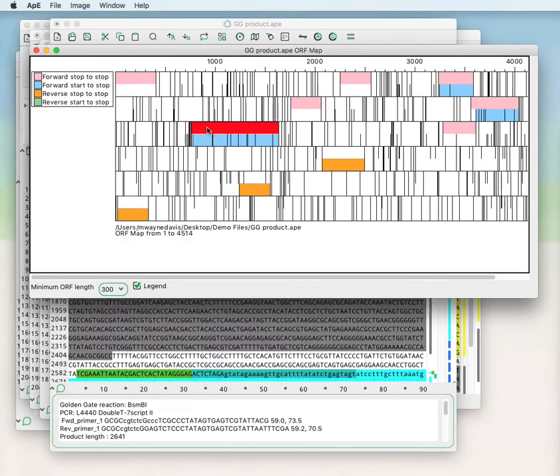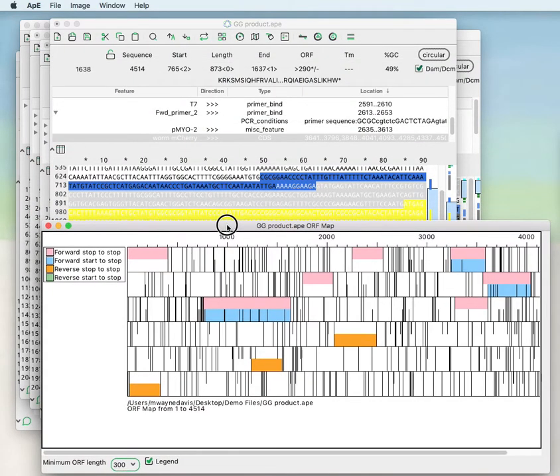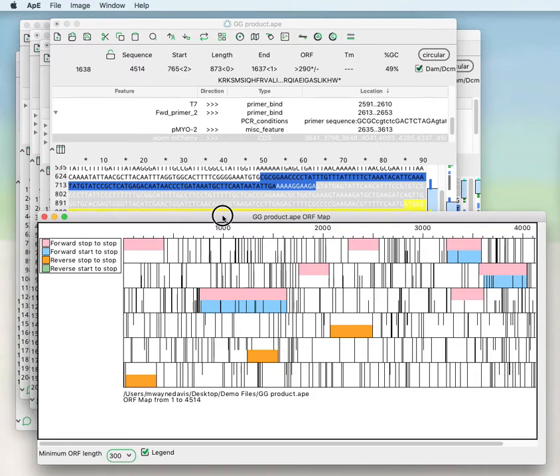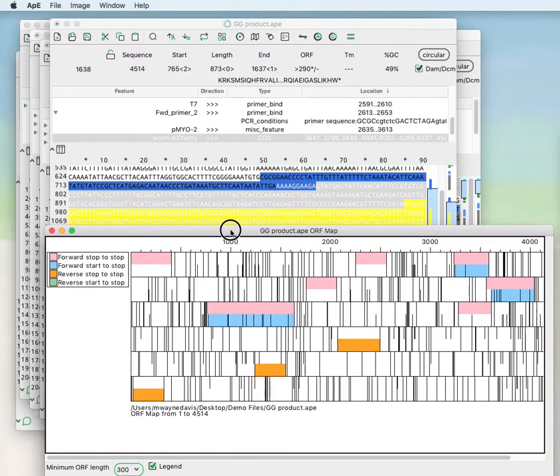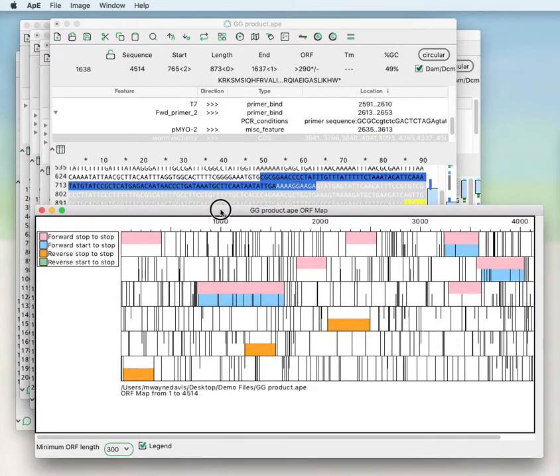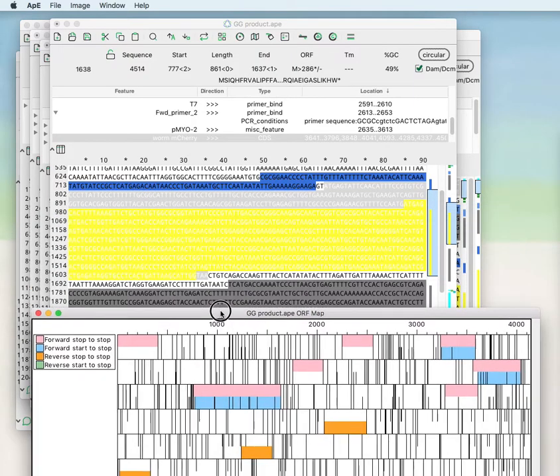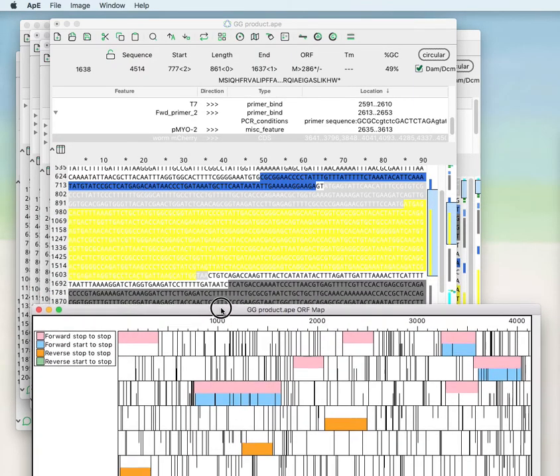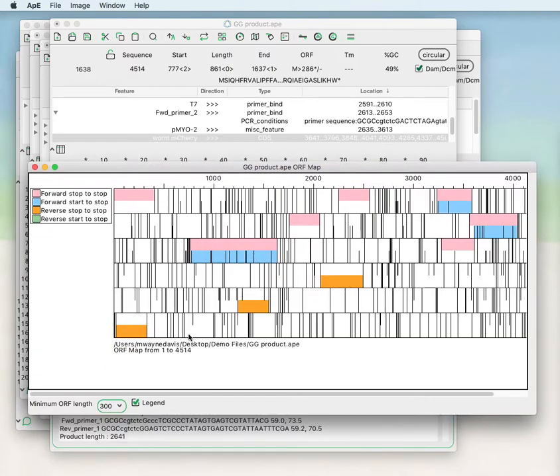If you click on any one of these, it will take the selection of the sequence to that region. For example, this is the ampicillin resistance gene in the backbone of the sequence.